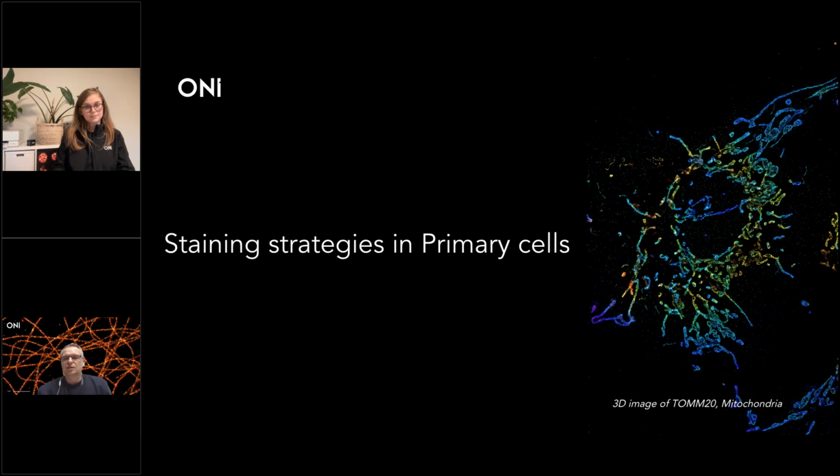And that's why, as I said, there's a limited number of fluorophores which can be used in this case, especially if you're using a high resolution mode, because you're using high laser power, so you can have a bleed through of some fluorophores to the other channel. So this is where a really careful selection of fluorophores, together with the imaging buffer for high resolution, plays a big role.